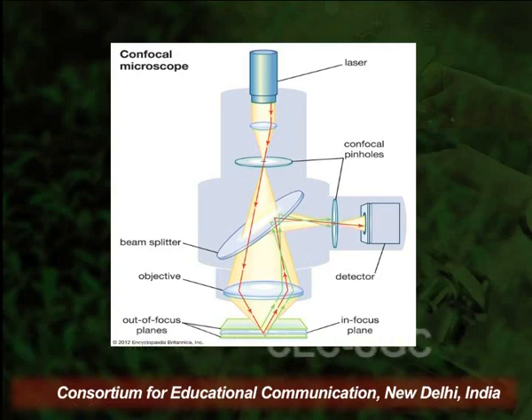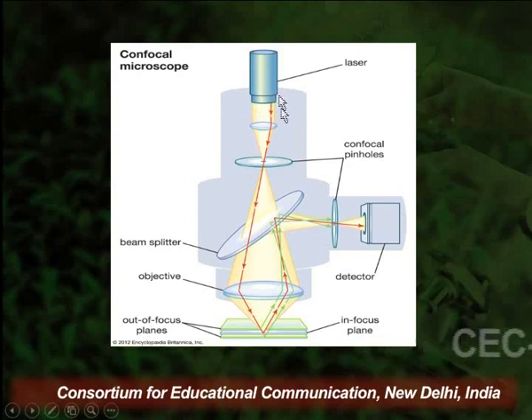So the diagram shows a basic light pathway of the confocal microscope.